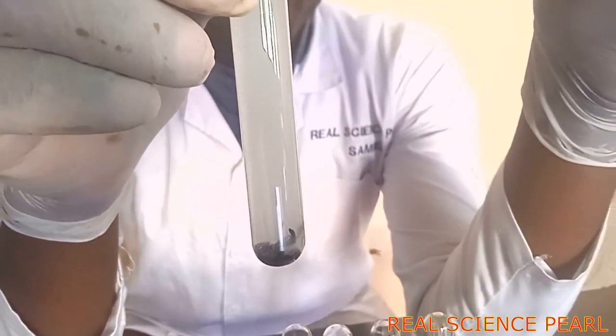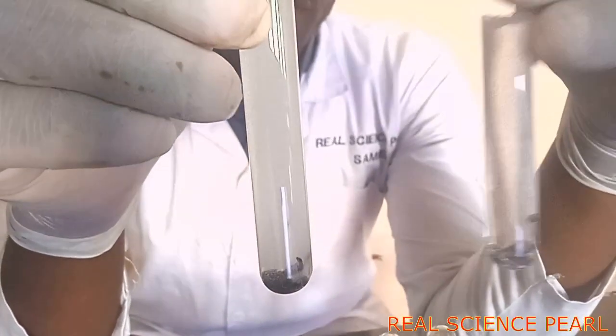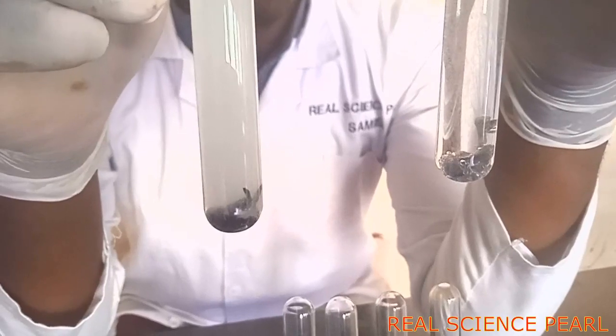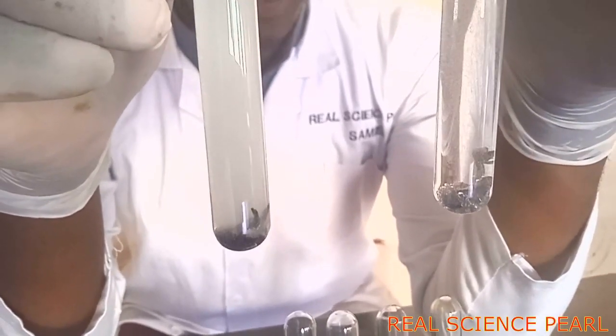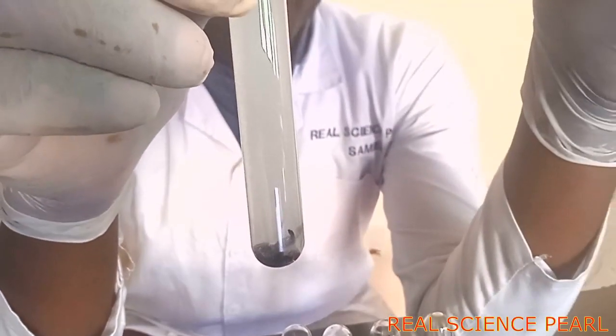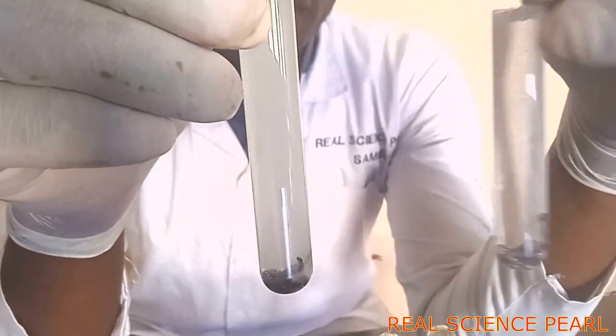Because if we try to look at the rate at which bubbles are being produced here and the rate at which bubbles are produced in this reaction where there is a catalyst, we can see that indeed the catalyst here has increased the rate at which bubbles are being formed.